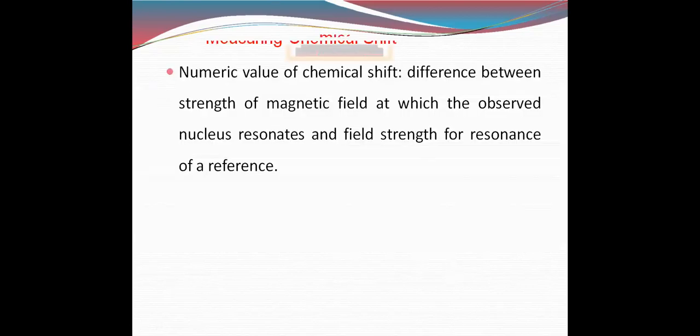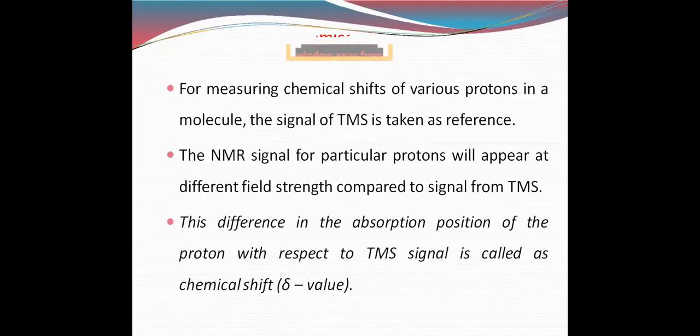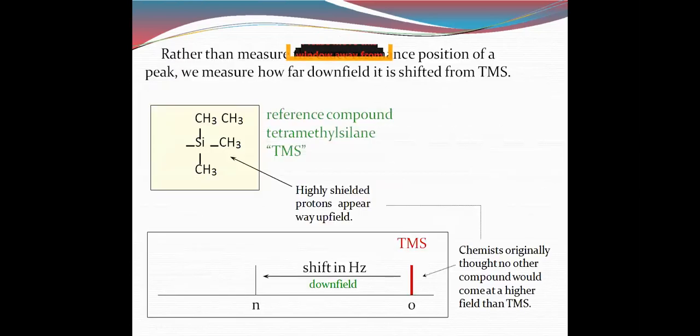Okay, so we had discussed the numeric value of this, and chemical shift. Students, look here, one example you are taking: TMS, tetramethylsilane. This methyl group is not single. Please consider it here: Si, silicon, has 4 methyl groups attached, tetramethylsilane.